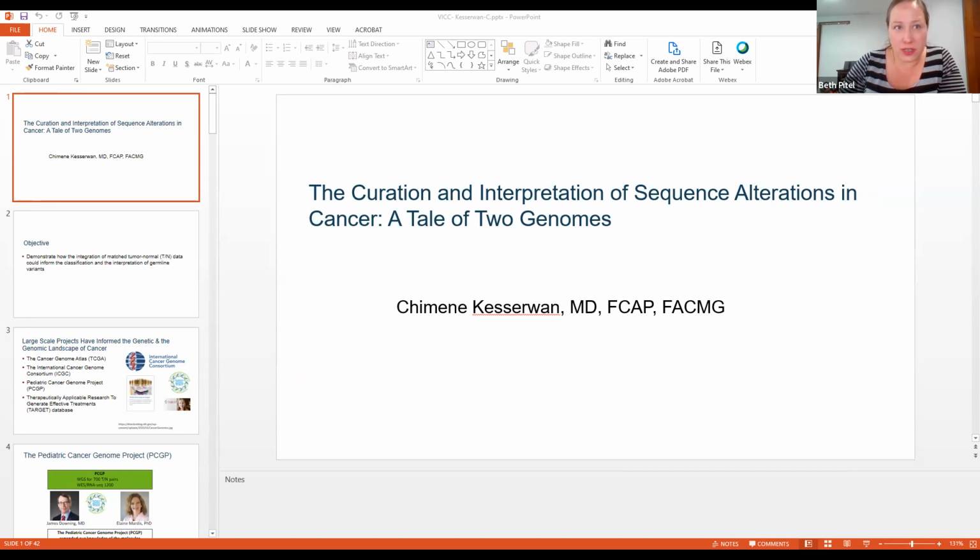So mutations that are in COSMIC or in CIViC will also show up in Protein Paint just as a separate track. And additionally, if you have mutations from your own data set that you would like to see visualized with that construct, there is a way to do that as well.